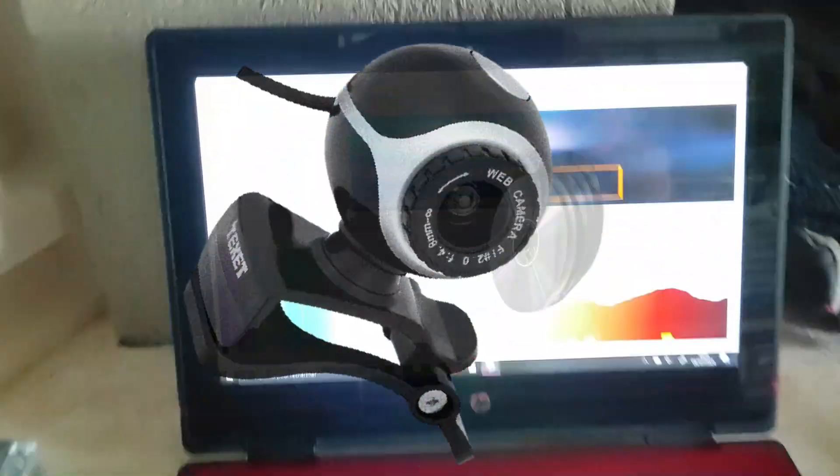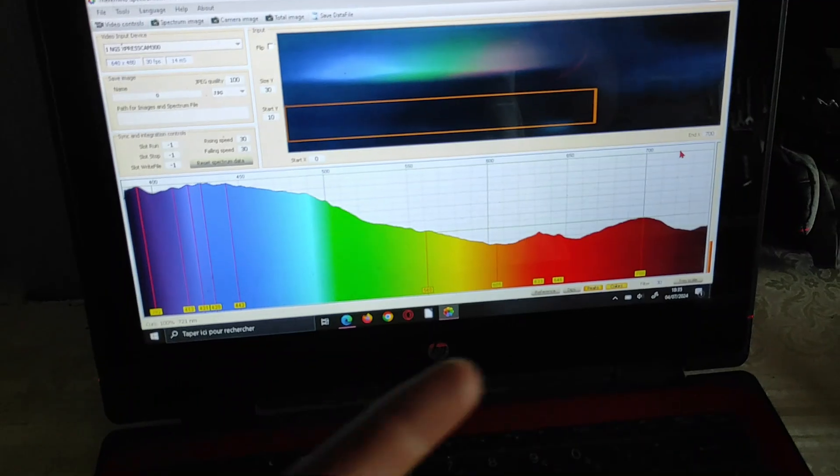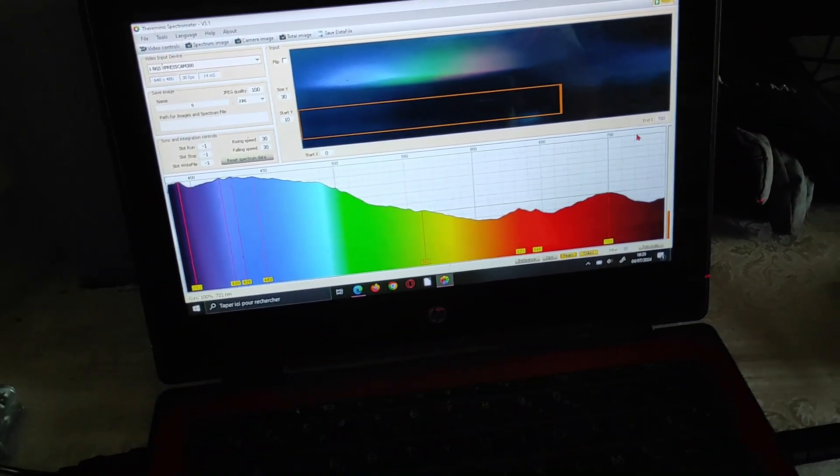Hello guys, today I'll show you how I made this DIY spectrometer from a cheap camera and a DVD. Surprisingly, it's good enough to analyze light from UV to near infrared and cost me less than 10 euros.